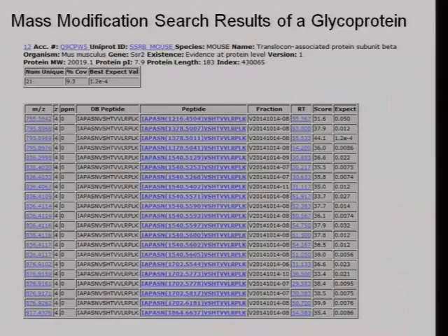I was not very clear. I refer to the nomenclature that you use in the software. Oh, okay. So because the mass spectrometry can't tell the difference between a GalNAc and a GlcNAc, or a galactose and a glucose. It's only saying that it's a pentose or a hexose or whatever. So we're calling them hex and hexNAc.